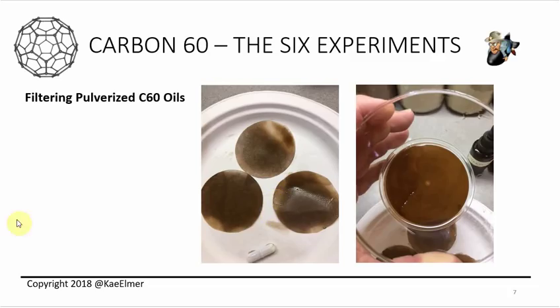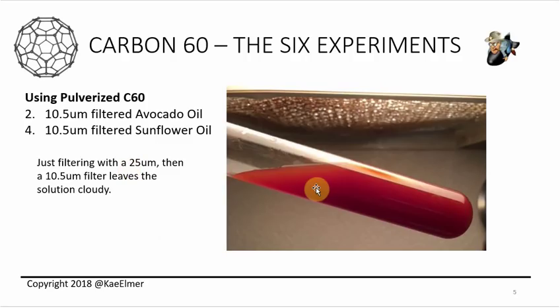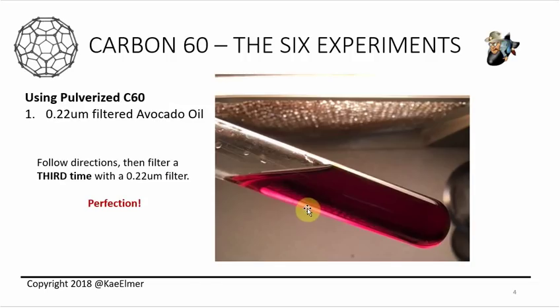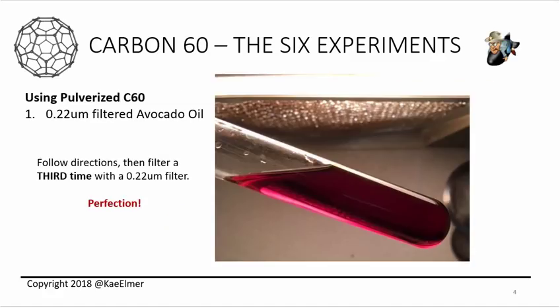And then I figured, okay, now that I filtered out the impurities, and then it looked like this, I wasn't happy. So let's go ahead and try filtering it through one of these to see if I could get it better. And then what happened was I got it better. But the problem was, this is the filter, and it got blocked so fast that I only got about 50 milliliters out of it. And so it is a huge waste of $7 if you're only going to get a little itty bitty bit of C60 oil out of it, the end product.